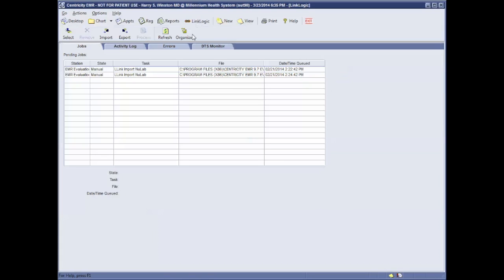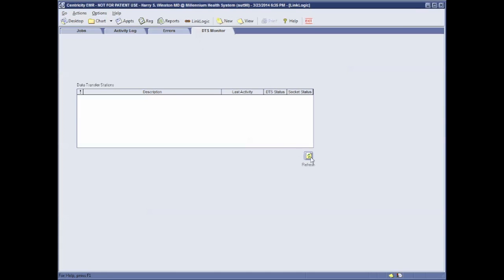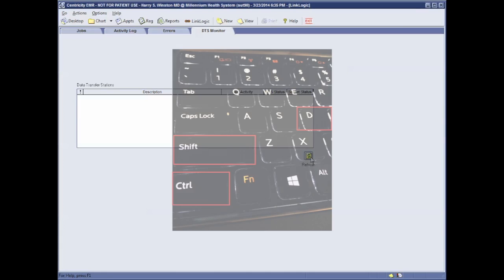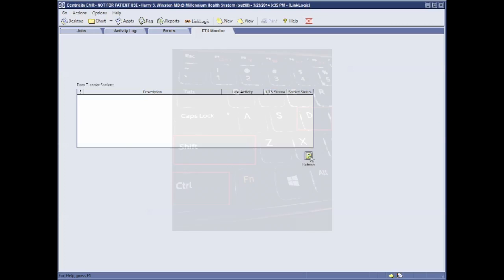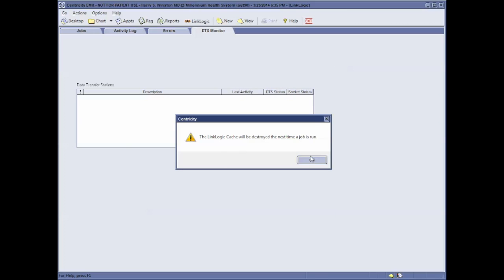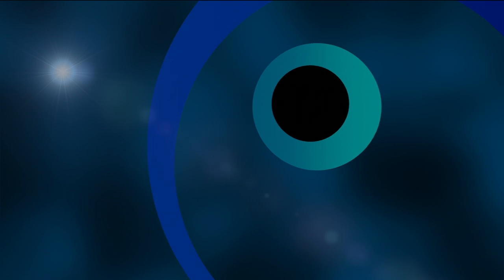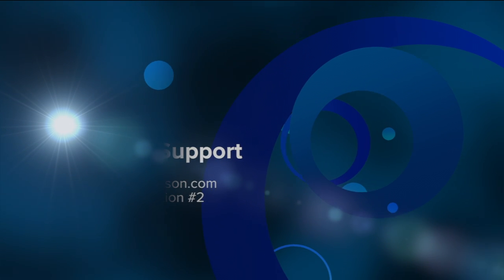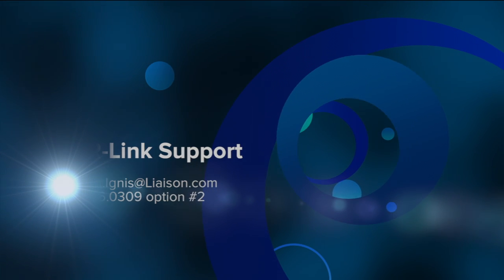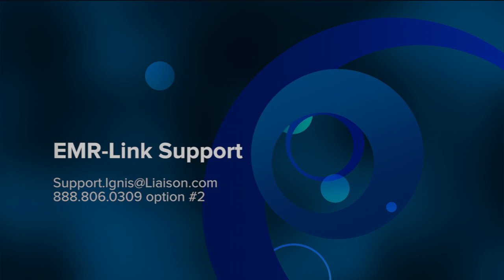The last step is to refresh your DTS. This will ensure that the LinkLogic recognizes your new cross-reference file. If you have any questions regarding this video or with completing your result mapping, please contact your EMR Link support team.